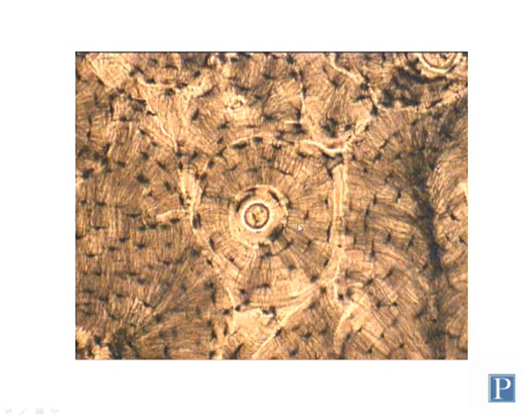At the interface between concentric lamellae is where you find the lacunae that would normally contain the osteocytes. In this particular case, these lacunae are all empty and trapped with air and bone dust, so they appear relatively black in this particular slide. In some slides, depending on the amount of dust or air that's trapped, they may appear either dark or light in coloration. So here we can see lacunae, these dark spots, and you'll see that the lacunae are at the interface between adjacent concentric lamellae.